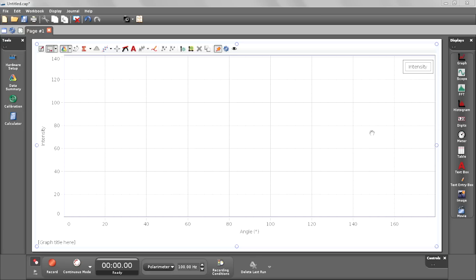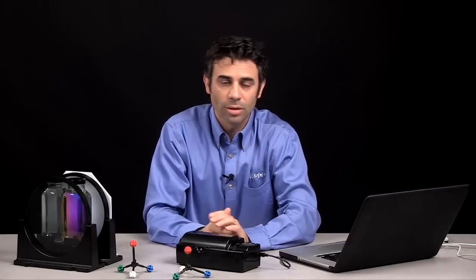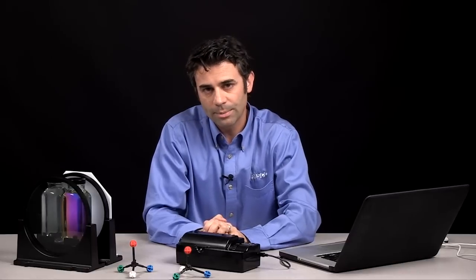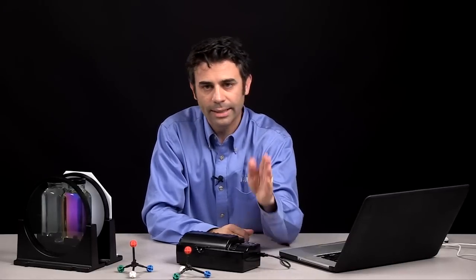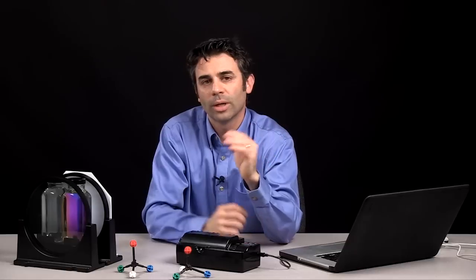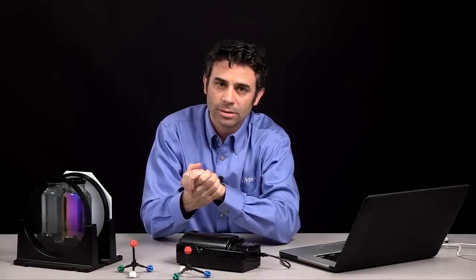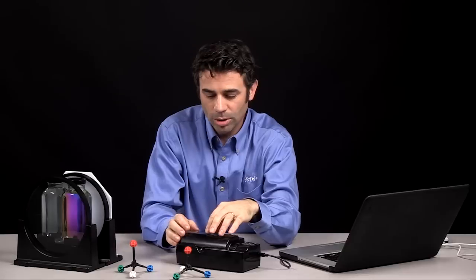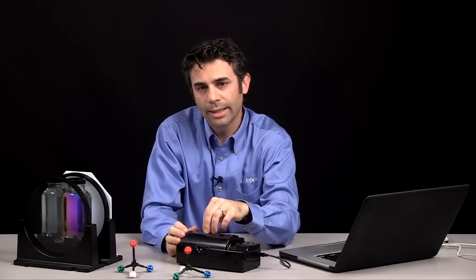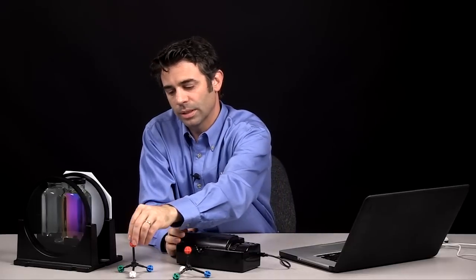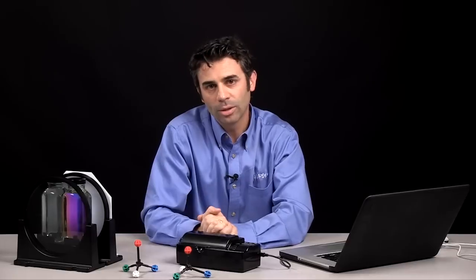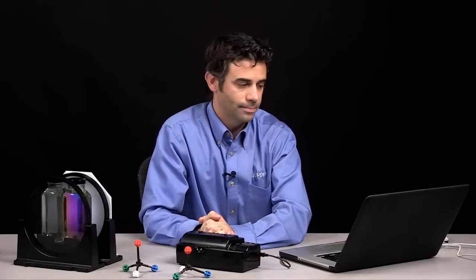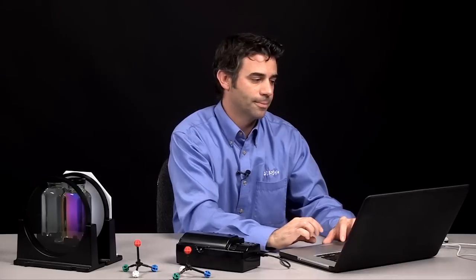I'm going to use PASCO software — you can use either SparkView or Capstone; in this case, I'm using Capstone. I'm going to find the exact angle of rotation where I get the most intense light through my water sample, and then I'll do that again with a sample containing a chiral compound, to see how we can measure that angle of rotation.